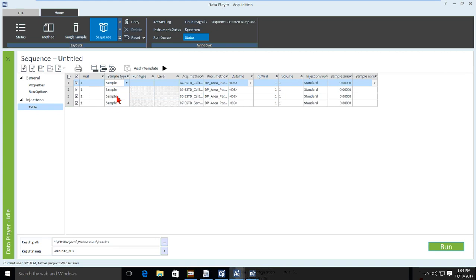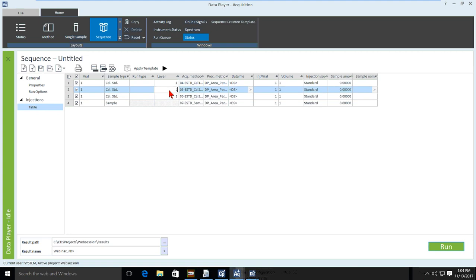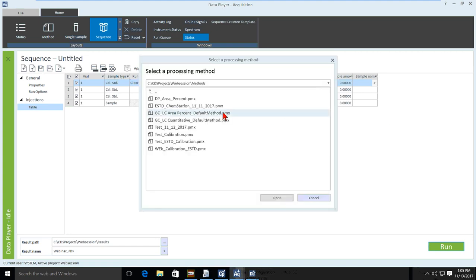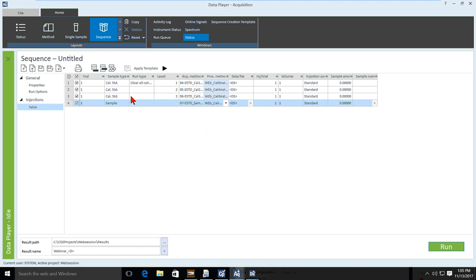So this is also where, okay, I've got 3 calibrated runs. All right, change my calibration standards. I can change my levels. All right, and then I can do clear all calibration. And then you have these options. So more specifically, let's go back to our calibration run, right? So then we actually utilize the calibration curve that we built into it. What we're saying is I want to clear all, right? And we're going to have 3 levels. So now I can do webinar. Let's see. We'll just call it workflow so I know which one, and then give it a timestamp.